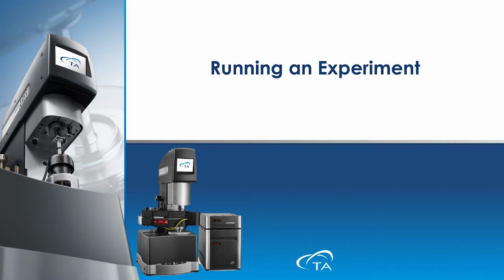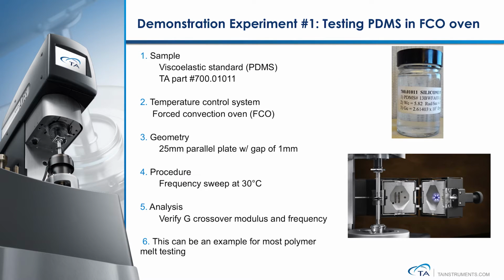Now we're ready to work through the basic steps for running an experiment. In this section, we're introducing testing 2 different types of samples in 2 different test modes. We will also use 2 types of temperature control systems with different geometries. The first sample we will be testing here is a viscoelastic polymer standard, polydimethylsiloxane. It is available and can be purchased from TA Instruments.